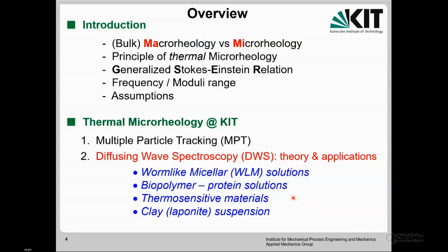So this is the first introduction part, but then I will focus on different applications using this DWS technique, say also some words about the theory, how this is working, and the different applications.